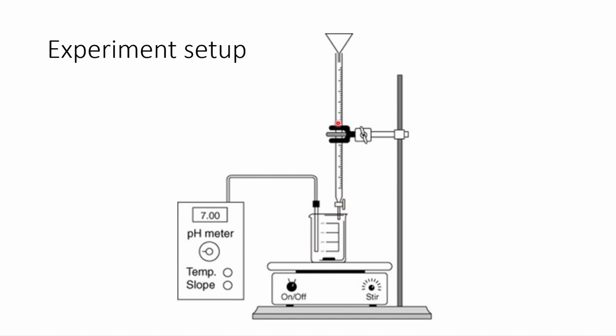It's important while you're adding this dropwise that there are not any bubbles in your burette that can interfere with dropping the liquid into the beaker. As you fill your burette, if you see bubbles, you can gently tap the burette to try to disperse them, or you can dispense out some of the liquid to try to move around some of those bubbles.